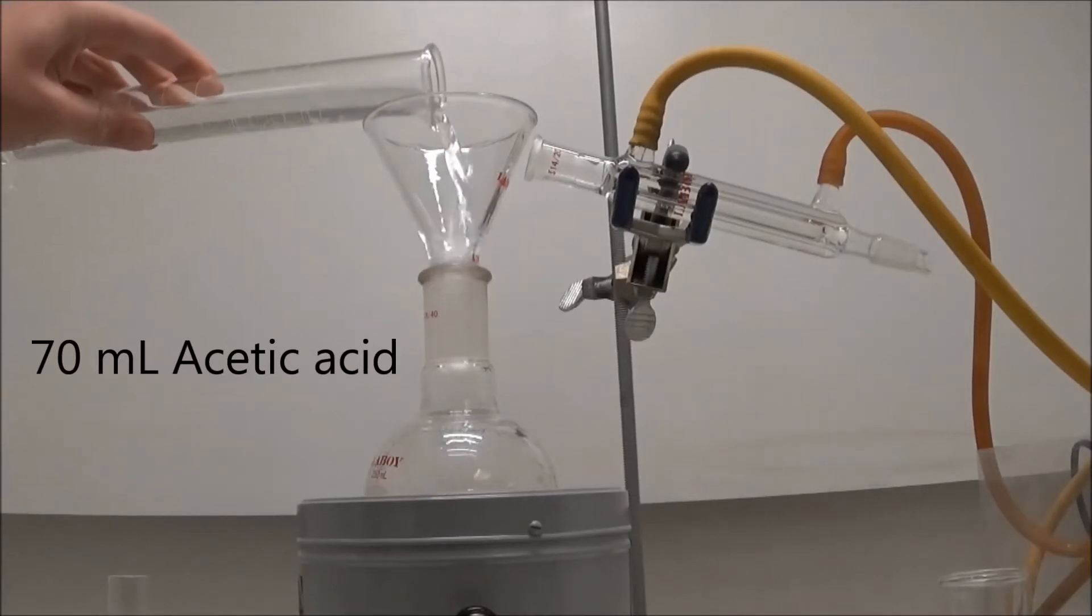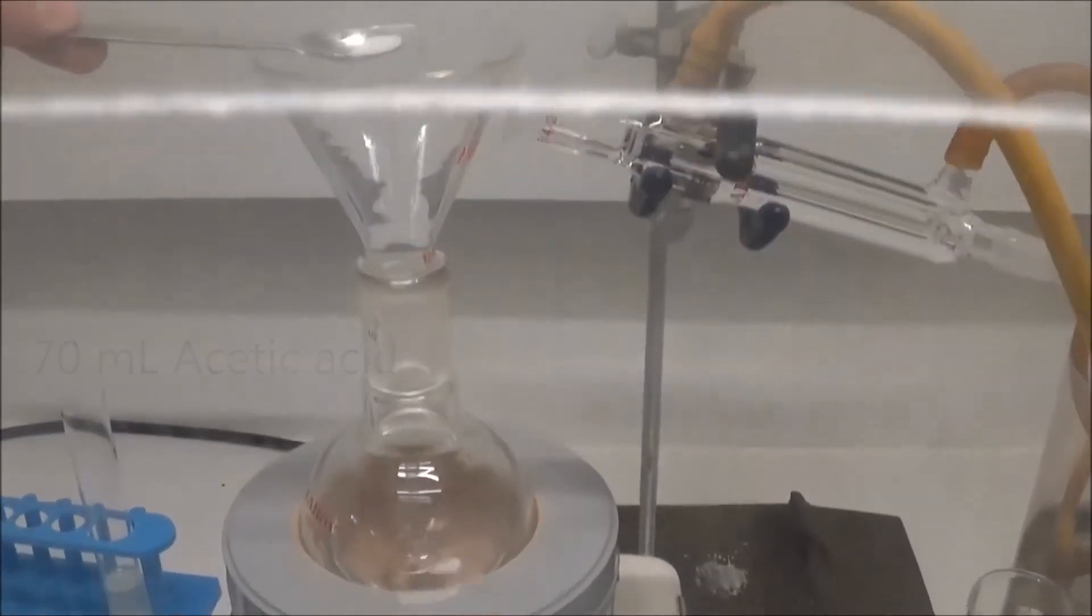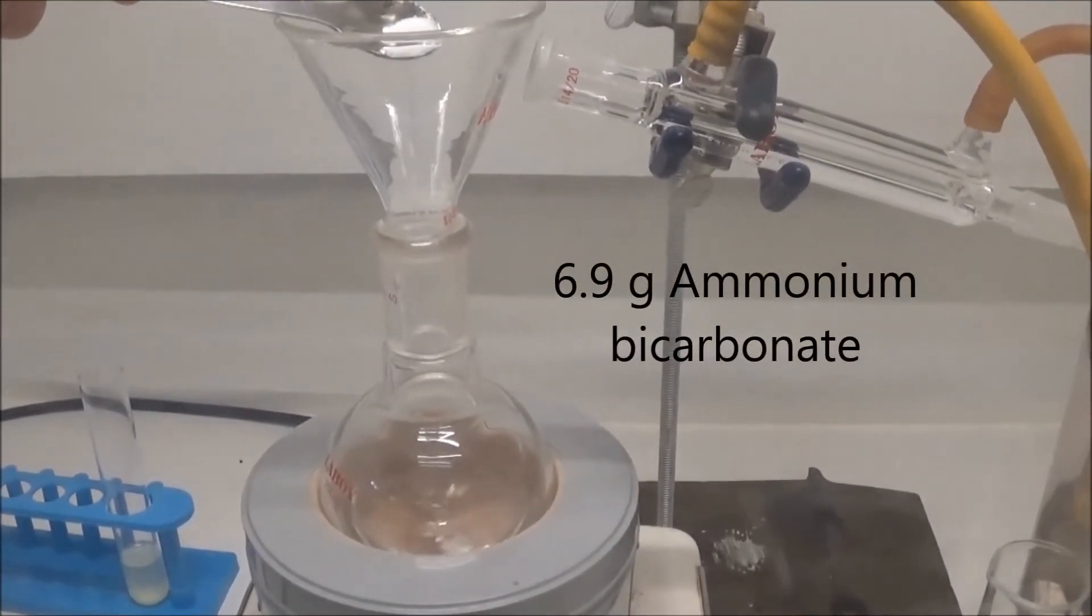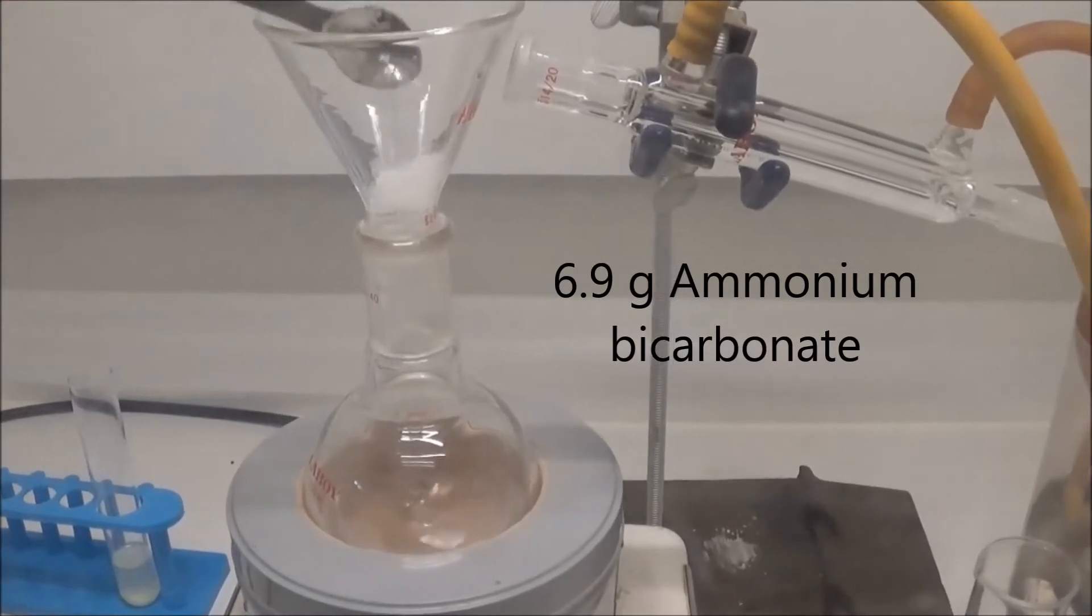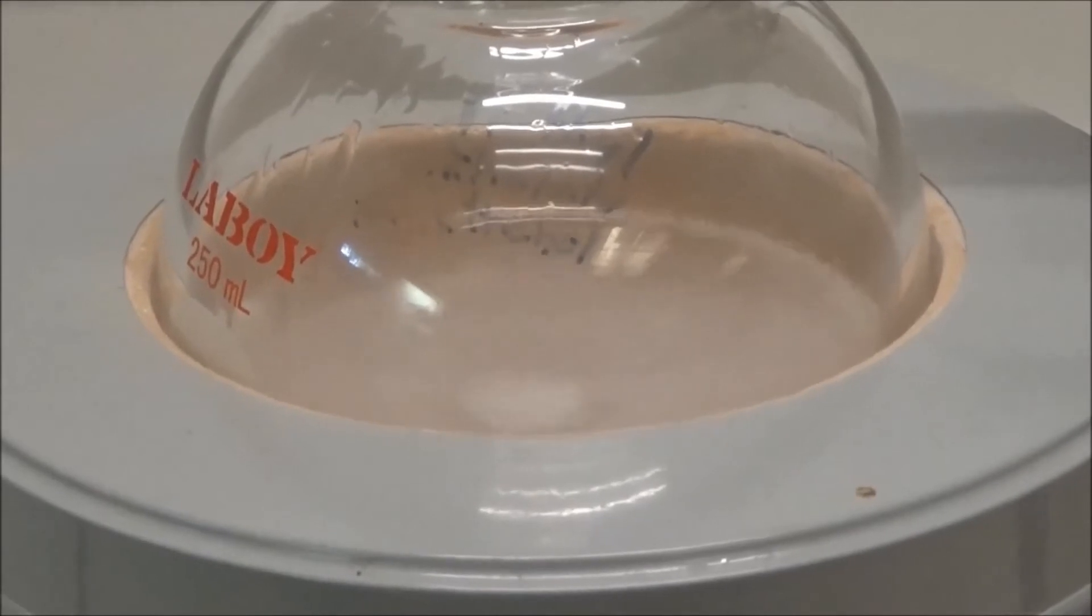To start, I added 70 milliliters of glacial acetic acid to a 250 milliliter flask. I then added, in small portions, 6.9 grams of ammonium bicarbonate. The mixture bubbled, and after it stopped bubbling, I moved on.